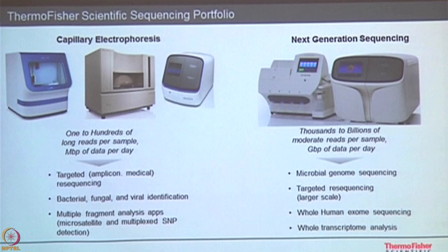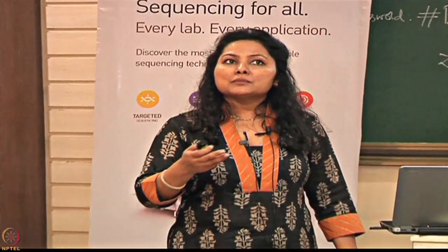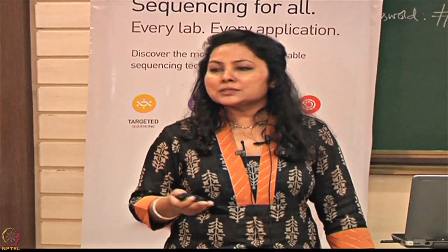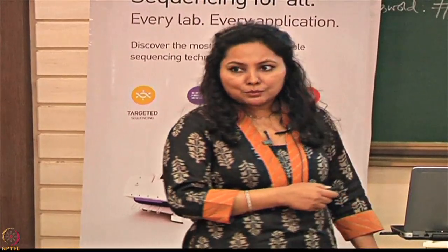So just to tell you, just because we are nowadays talking a lot about NGS, it is not that capillary sequencing has lost its charm or has lost its utility. It is still a very user-friendly technique for a lot of applications. For things wherein you do not really require a lot of data, things can be done simpler. For a lot of microbial research or a lot of single gene based tests, they can still be done very well and very efficiently on capillary sequencers.